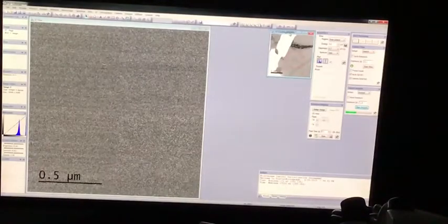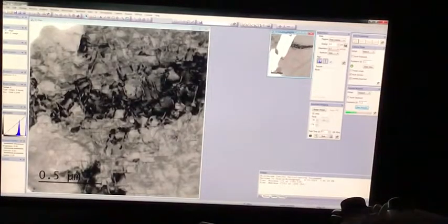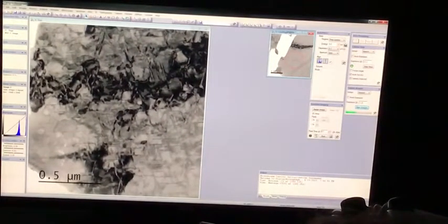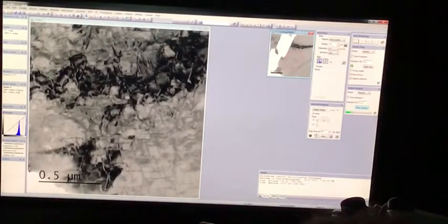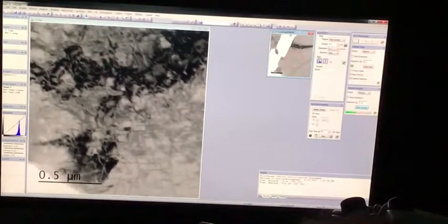So let's have a look at the image. We're at slightly higher magnification now, 25,000 times. I'm going to go down a bit, and we can raise the screen, have a look, but I'll first move the camera. Let's raise the viewing screen, have a look. Oh yeah, okay, so there's a lot of bend contours, and we move around a little bit. You can see all these nice long precipitates. Now much sharper.